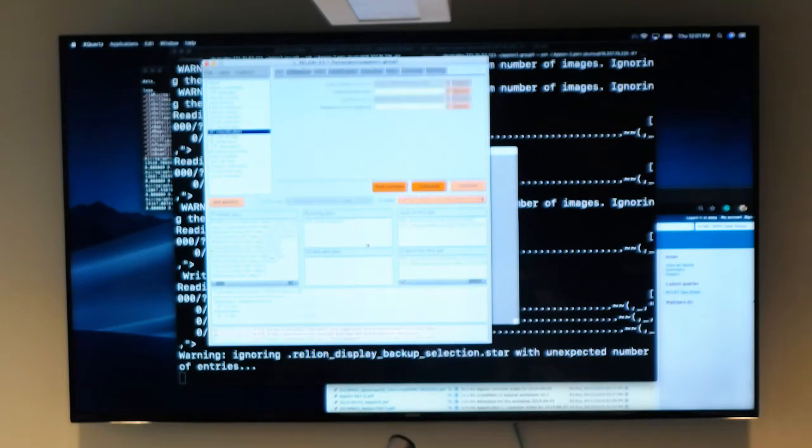Afterwards, I did a 3D classification using the initial model, and I chose 3 classes. If you just show the model.star, you'll see the 3 different classes come out. You can use classification as additional criteria to assist you with some sorting.